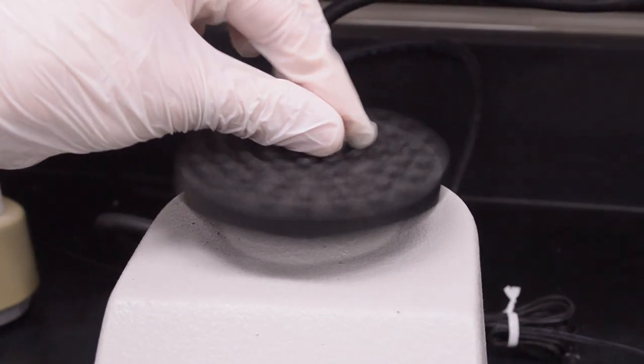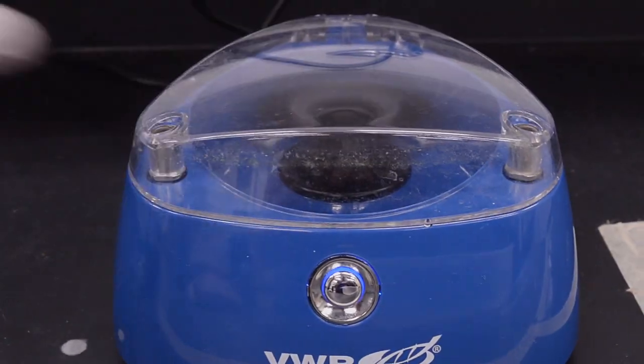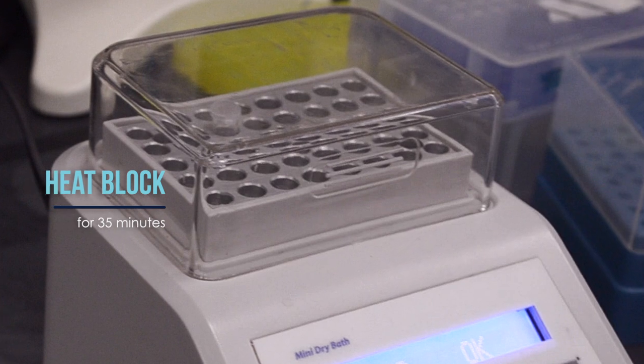Vortex and centrifuge the sample, then place it in the heat block for 35 minutes.